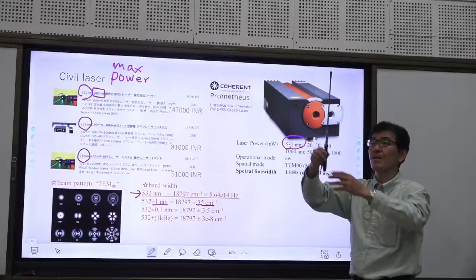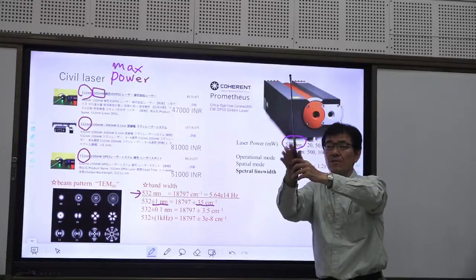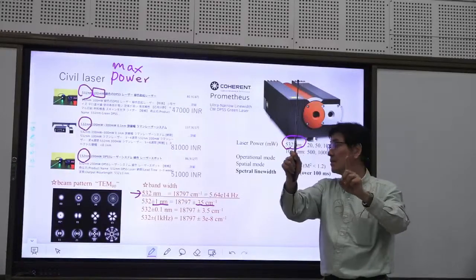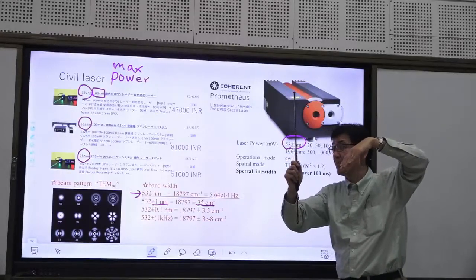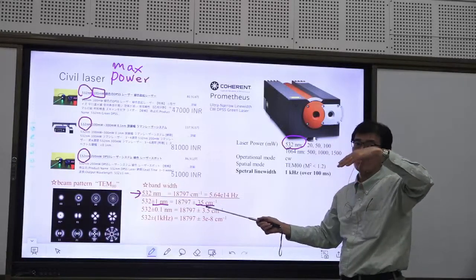So Rayleigh line has width. Accordingly, Raman signal has a width. It is inevitable to detect broad Raman line. This is not convenient. We cannot discuss peak shift as small as 1 wave number.